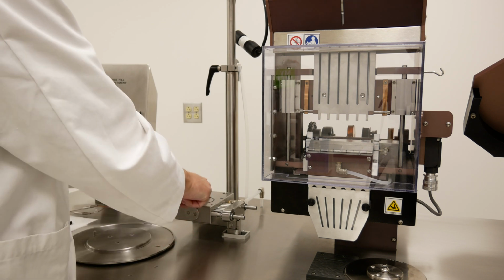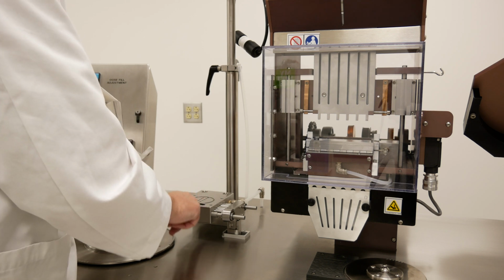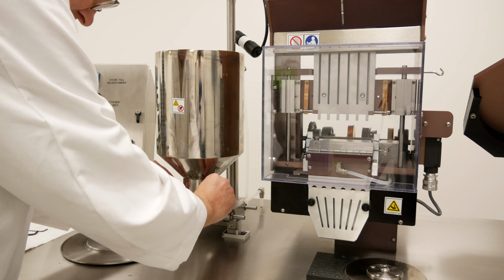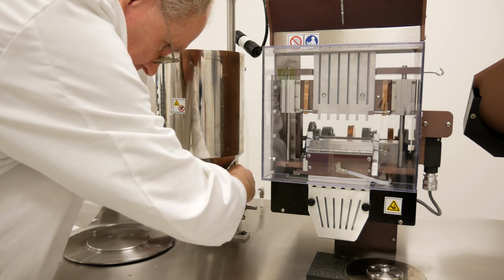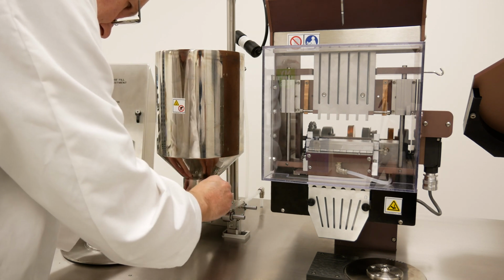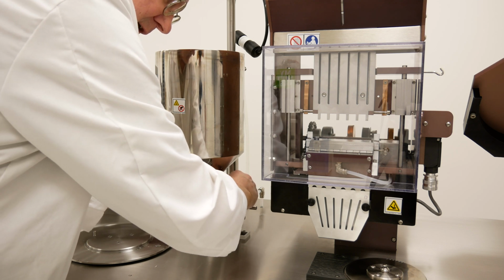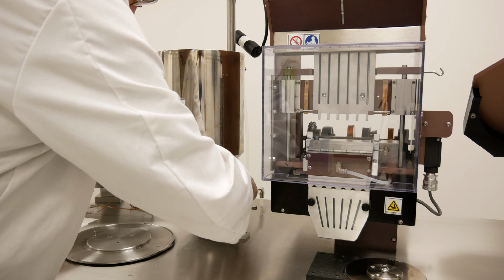You want to re-examine and make sure both of these O-rings are on your pump block. There are 4 bolts. Again, you want them finger tight and then just a slight snug to tighten them up.